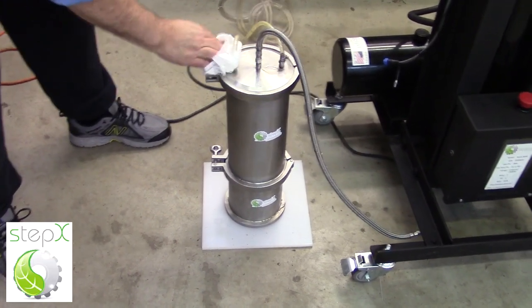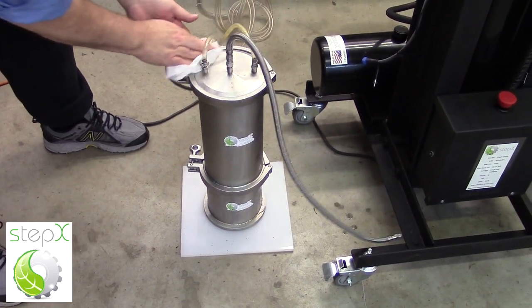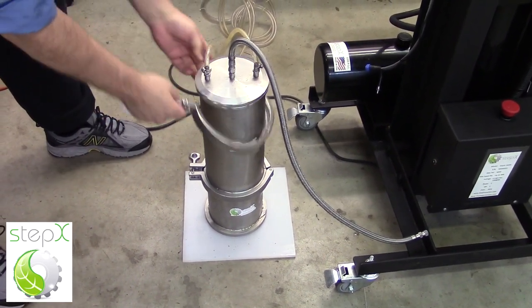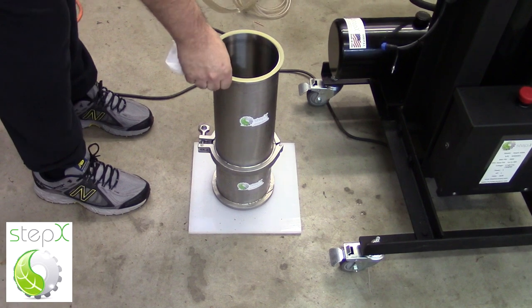Now it's time to open up the collection vessel to see what's inside. I wipe up all the condensation to make sure that no water interacts with my material on the inside. This is always a low pressure vessel so it's hand-tightenable.